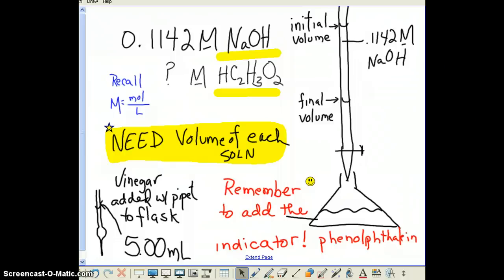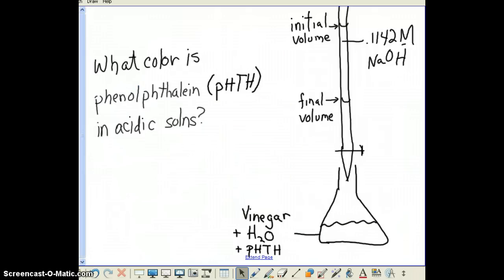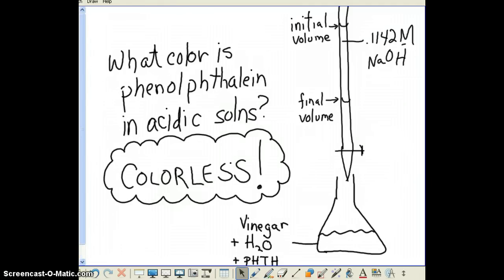In order to know when to stop adding the base, the key is to use phenolphthalein. So let's back up a minute and try to recall something about phenolphthalein as an indicator. It is an acid-base indicator, so its color is going to change during this titration. Do you have notes? You should have notes of what is the color of phenolphthalein in acidic conditions. You measured these. Some of you used phenolphthalein in a previous lab. You might pause or think about this. Yes, it is colorless in acidic solutions.